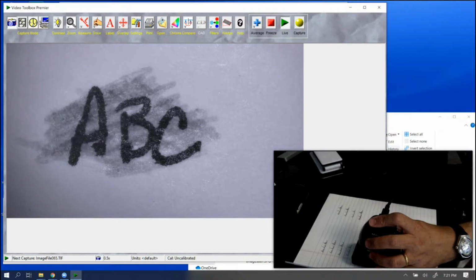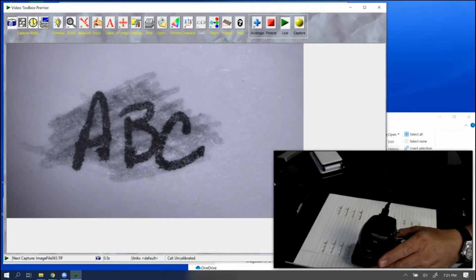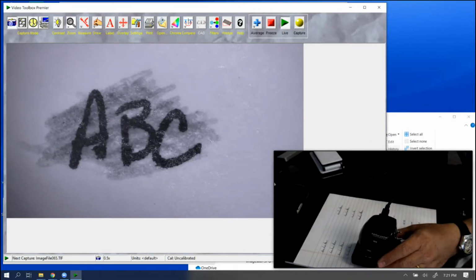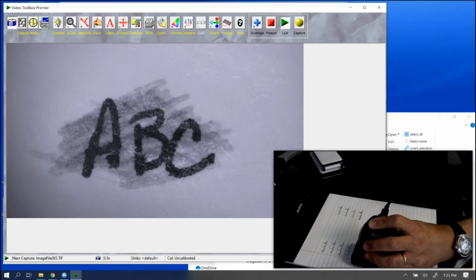Now, it's important to note that this technique is not guaranteed. That is, we can look through this obliteration because, in this case, the ink that was doing the covering becomes transparent in infrared, and the ink that was written below is quite dark. But it's also possible that those two different inks that were used have very similar characteristics, in which case it wouldn't be possible to see through it. So this is a technique that can provide results, but there's no guarantee.